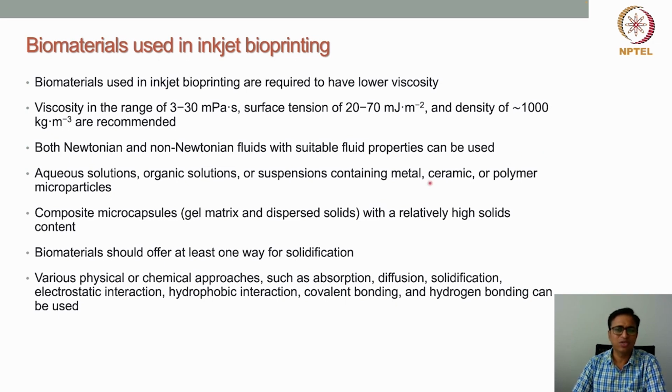We can use different types of solutions and formulations with inkjet 3D printing technology. Either we can use aqueous solutions, where the material is dissolved in an aqueous medium, like some hydrogel or any aqueous solution. Similarly, organic solutions, where the biomaterial or pharmaceutical material is dissolved in some organic solvents, are also possible.